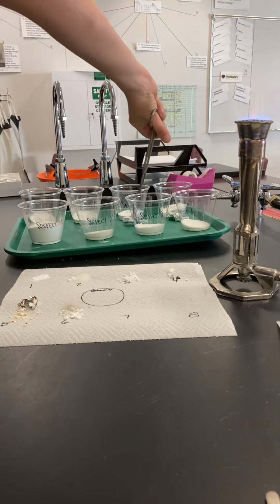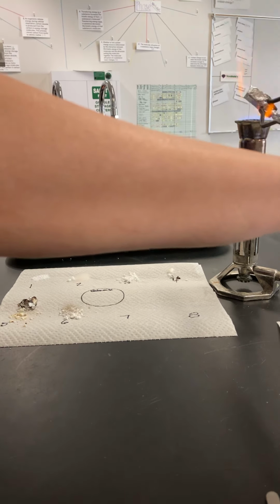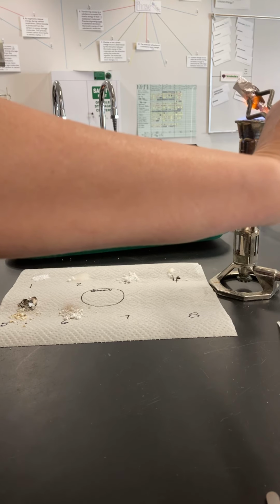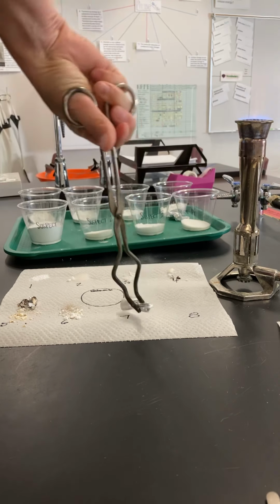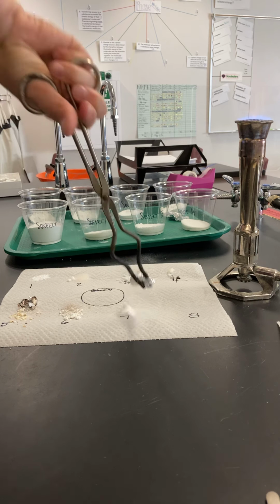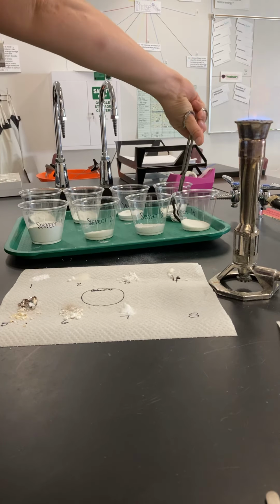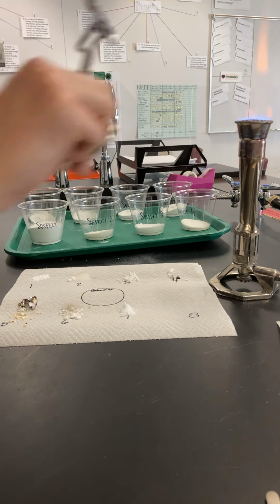Substance 7 or suspect 7. 1, 2, 3, 4, 5. Looks like there's no change whatsoever to that. Okay, so it's exactly the same as it was. Didn't change color, nothing. Okay, and finally suspect 8 or substance 8.